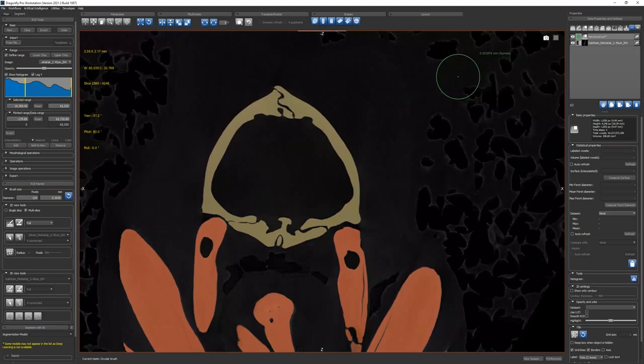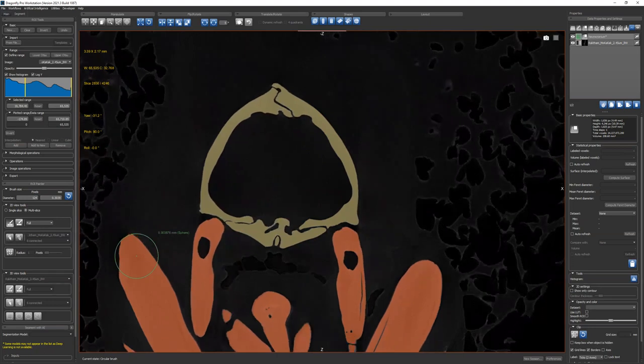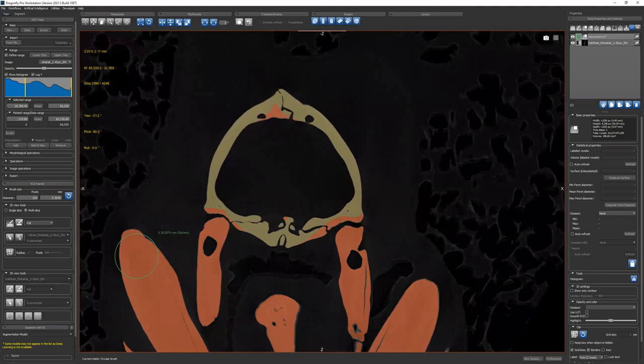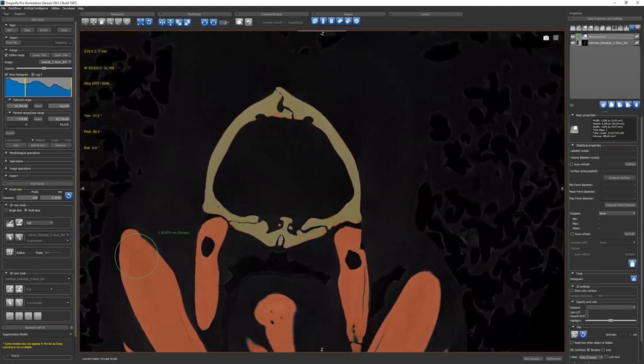So you have to start thinking about now. Imagine I still had multi-slice selected and I said, I don't like that. I'm going to hit shift and do this and delete that. But you have to remember the reason that happened in the first place is it wasn't the right size the whole time. So my big brush is now going to encroach here. And that actually, I just caused that. So it's kind of a dance of how do I do this?